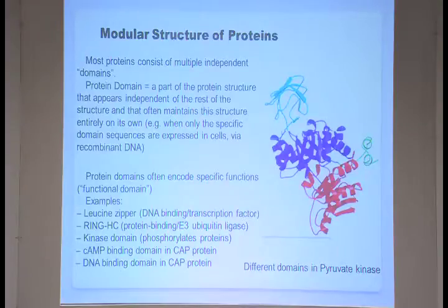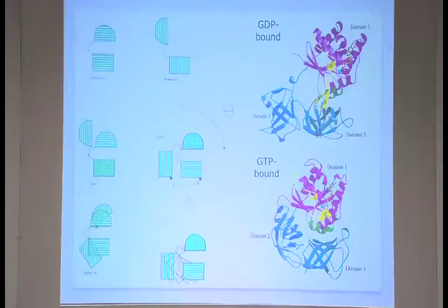Most of these proteins have many big domains, and many times each of these domains has a specified function, and performs its function by some conformational changes. Most of the time these changes are based on hinge motion.